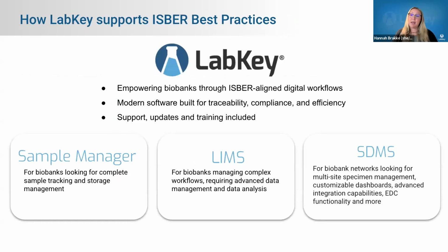And so at LabKey, we're really aiming to empower biobanks with ISBER-aligned digital workflows that help make it easier to operate with confidence, traceability, and compliance within the biobank. So what we've done is really built our products to build on each other. So biobanks can choose what tools meet their needs the best, whether that's a small single-site collection or a large distributed network. We have a solution for folks on either end of that spectrum.